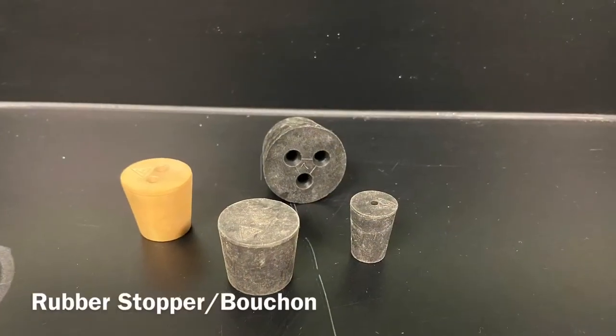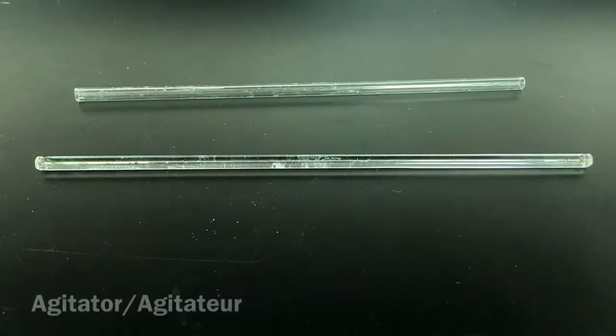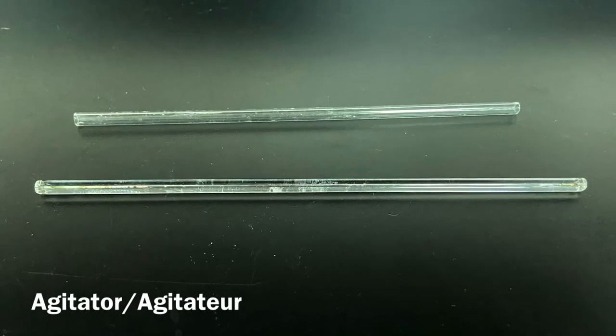Rubber stoppers. Bouchon. Agitator. Agitateur.